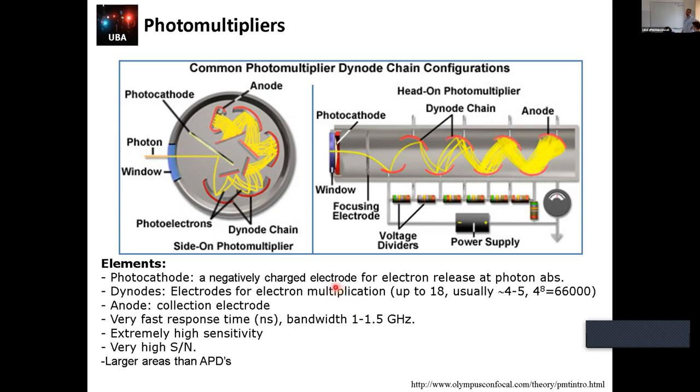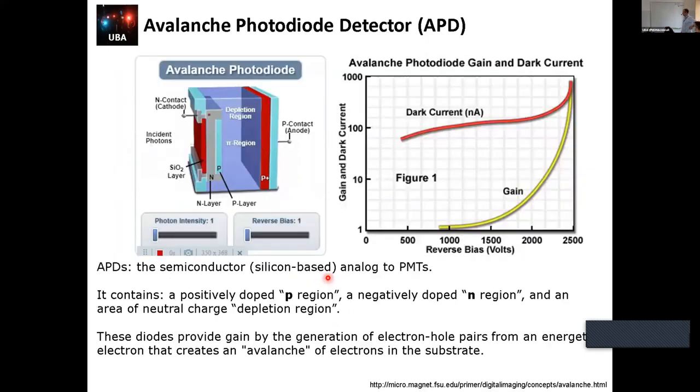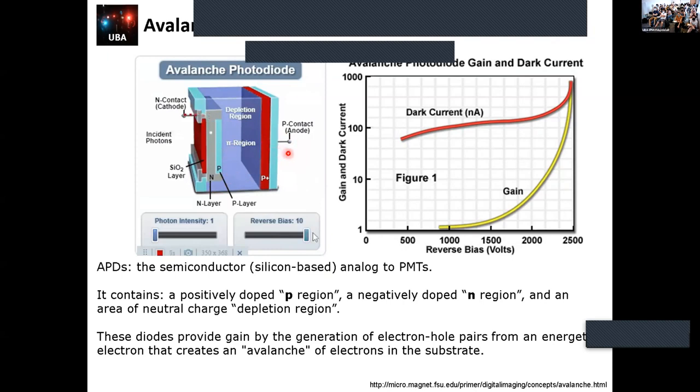And this is fundamental for FLIM measurement, because we will need to have many, many windows over time, and we need to collect the photons at the proper time in our detection. So then we have the avalanche photodiode, and the avalanche photodiode is different. We have a depletion region, and then two areas. One is doped, known as a positive doped or negative doped region. And then if we change the potential between these two points, we can increase or decrease the number of photoelectrons released per photon hitting the active area.